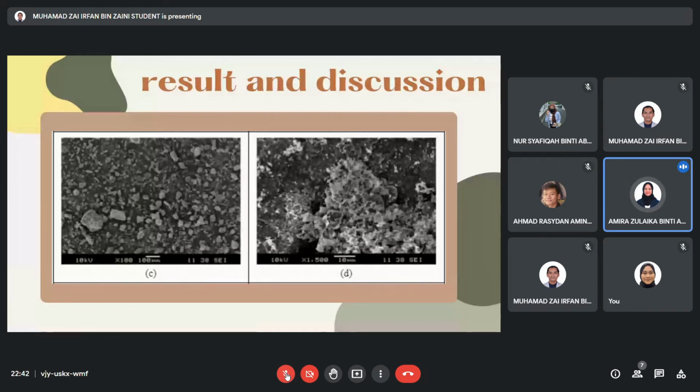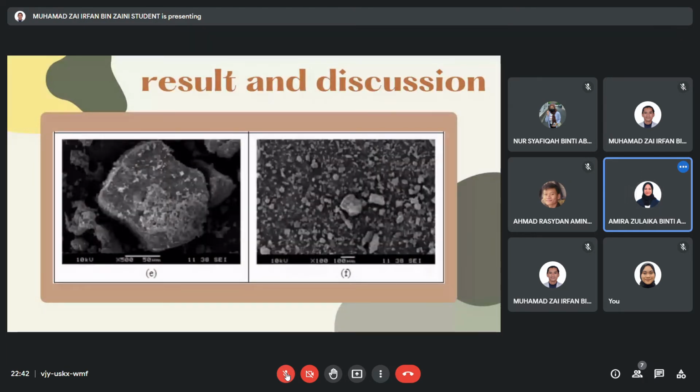To understand the structure, which the geopolymer behavior implies in more detail, the samples were analyzed by the SEM method. In this experiment, we only focus on the surface of the sample. The SEM analysis is done up until the surface and is not further continued to the EBSD.